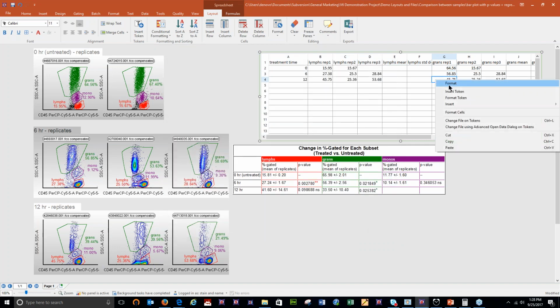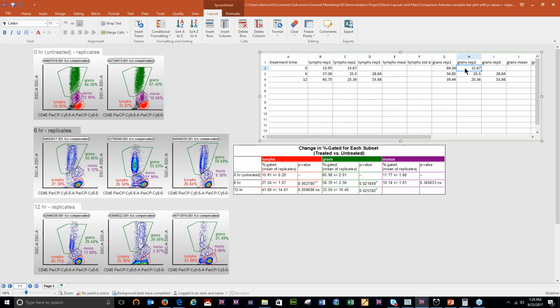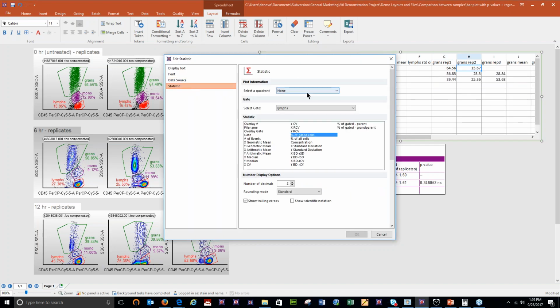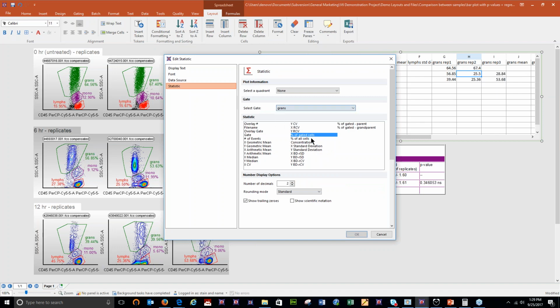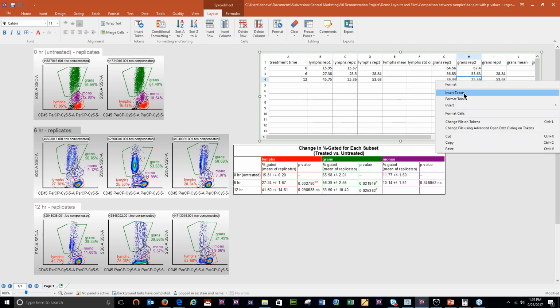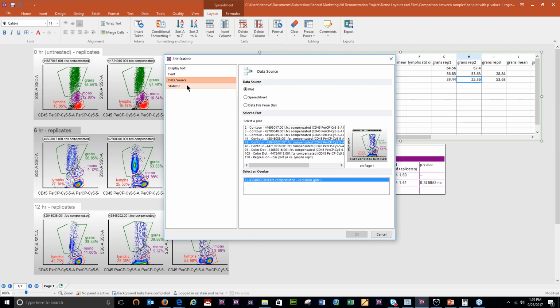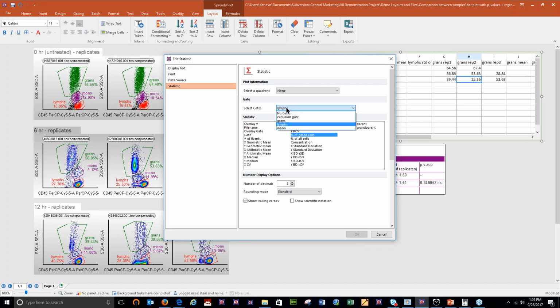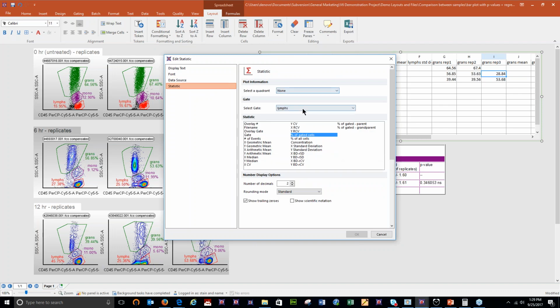And I believe we have had customers ask for a batch edit. So we don't have that right now, but that is on our radar in case that was the question on your lips. But hopefully this is not too hard to do. So I'm just going on here and I'm changing all of these, because basically the plots are the same, the statistic % of gated cells is the same. I just need to change the gate for all of them. And that's why it's fairly straightforward to just do that one by one.